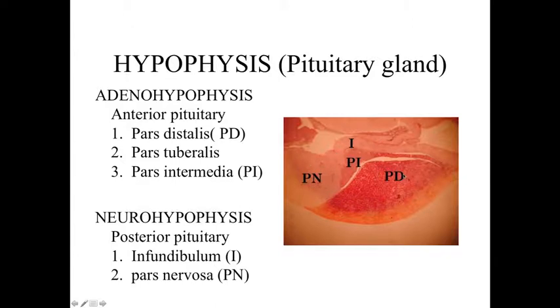Wrapped around it, we're going to have the anterior pituitary, identified by the pars intermedia, located essentially between the pars distalis — this very dark, distinctly staining region — which is the prominent region within the anterior pituitary. We're also going to have the pars tuberalis, which kind of wraps around the infundibulum, but we don't really see that on this slide.